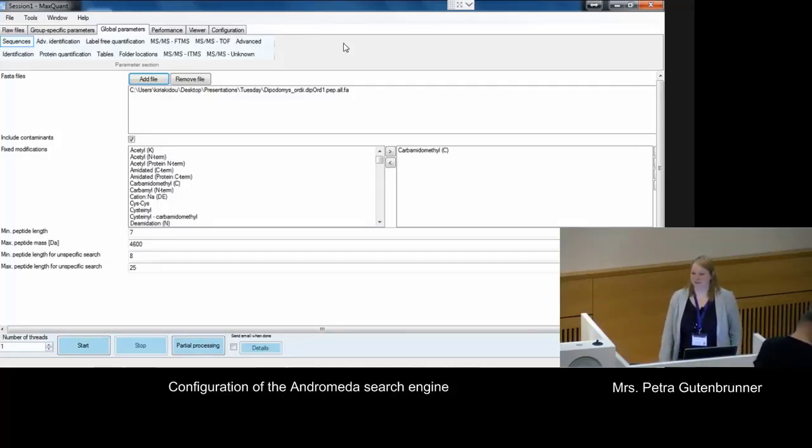So yes, you're totally right. There's a lot of synchronization. The only thing that you might notice is that some pseudogene sequences, the sequences which contain asterisks in the sequence, in Ensembl, we don't import them. So that's the only main difference. No pseudogenes in UniProt, but for the rest, they are synchronized, so they are pretty much the same. Okay, thank you.